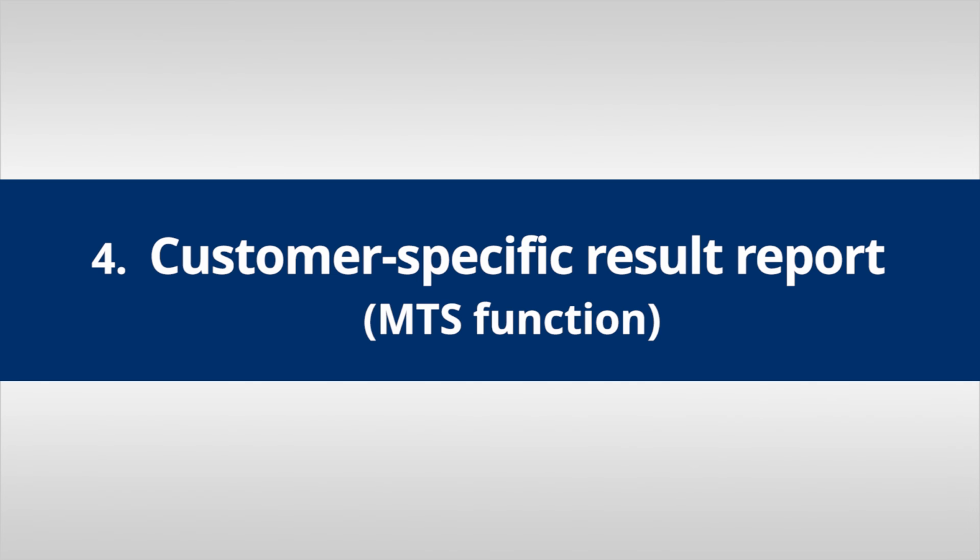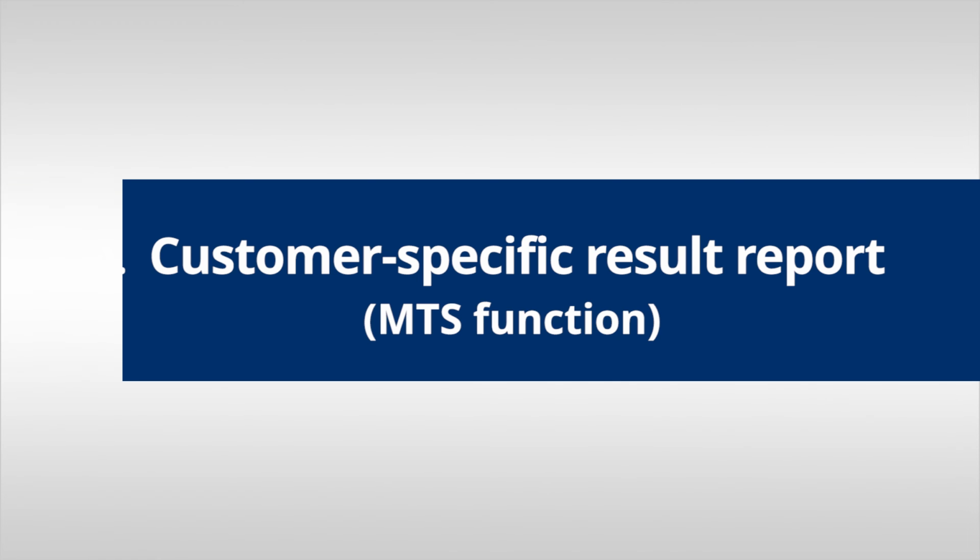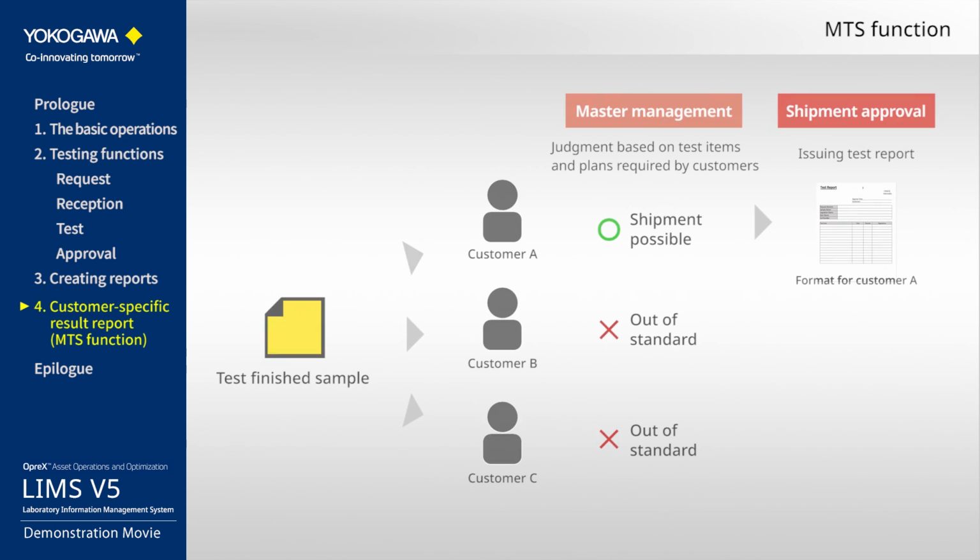Customer-Specific Result Report (MTS) function. The MTS function is used when a user performs shipment decisions for individual customers. The system determines if the results of sample tests meet customer requirements and if shipment is therefore possible.